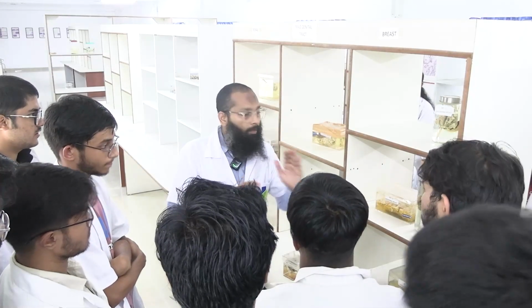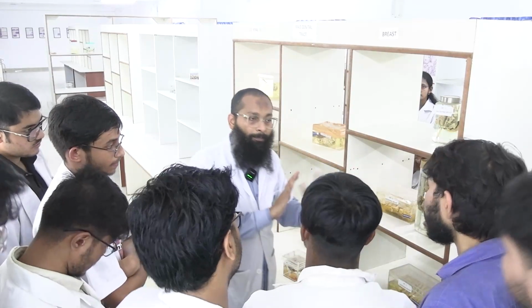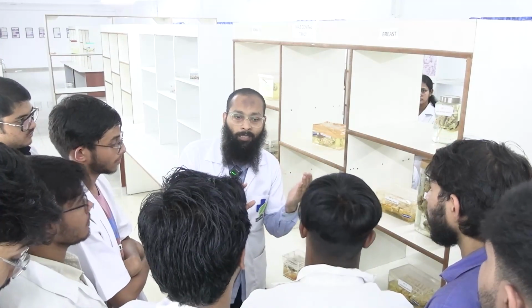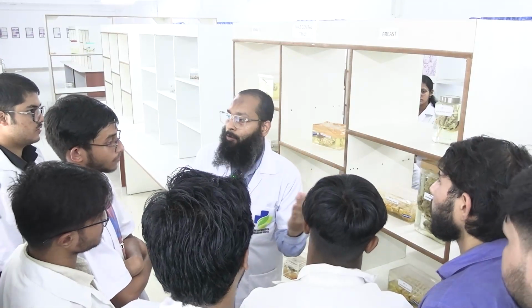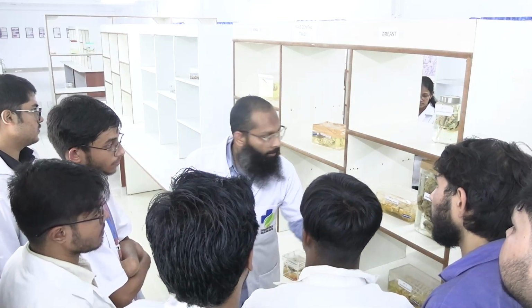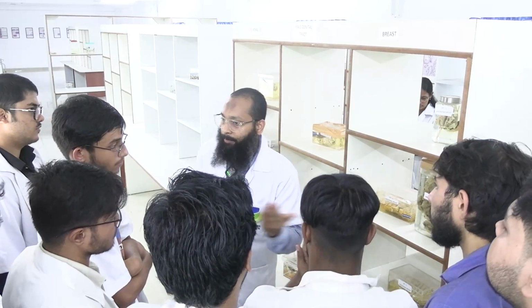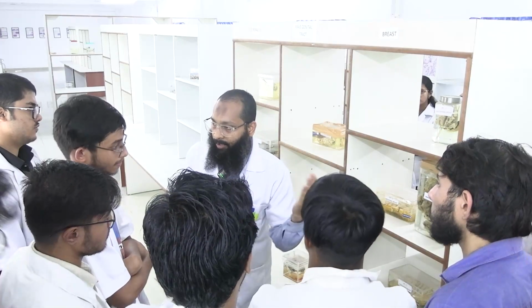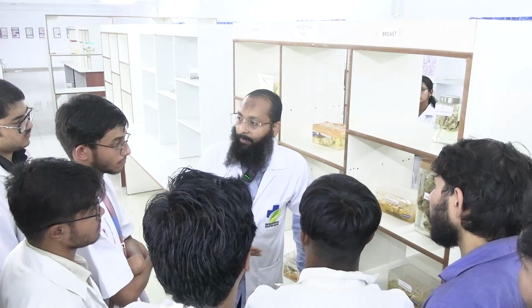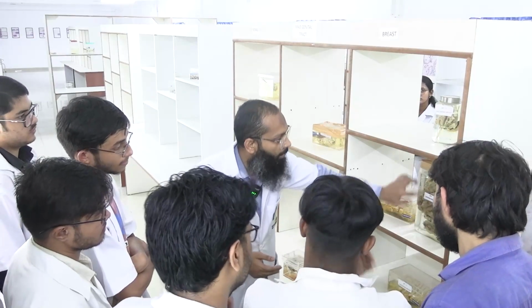This specimen was initially present in the patient's body. The surgeon has cut it out with the help of his knife. The surface cut by the surgeon's knife is the surgical resection margin. So this is the base of the specimen.